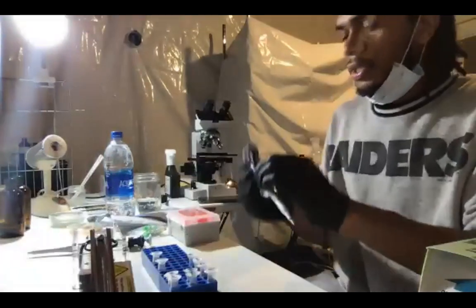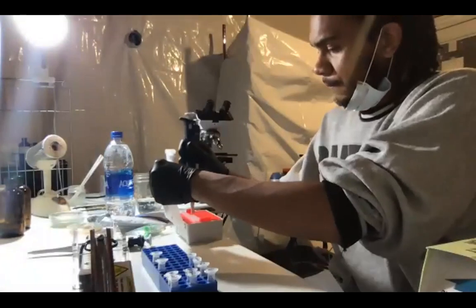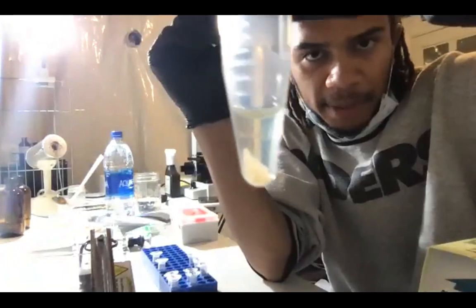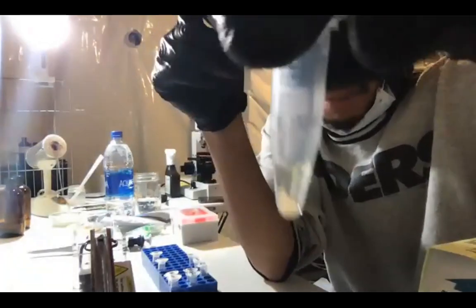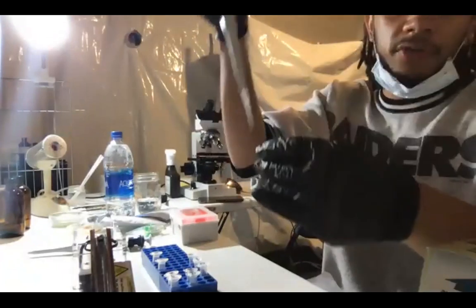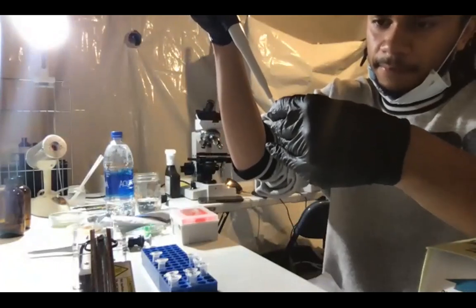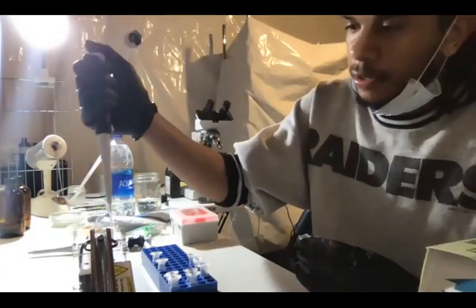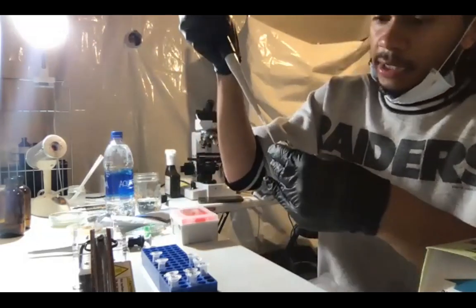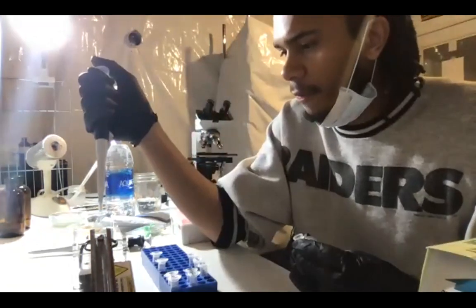So what I'll do, I switch my smaller pipette to 1 microliter. And when you draw up liquid from these, remember that you don't want the pellet at the bottom, so just stick your pipette tip in at the top to pull liquid out. And you can use the same pipette tip for both because you didn't add the primers in the PCR tube yet. So I got 1 microliter. And then again, take another 1 microliter and put it in number 5.